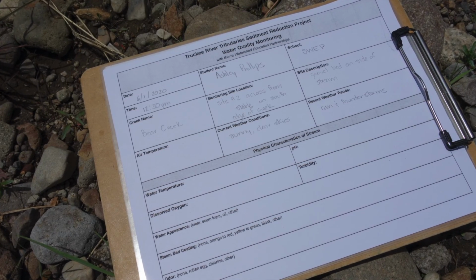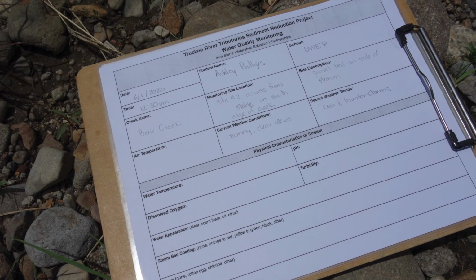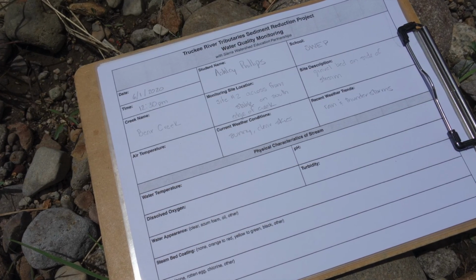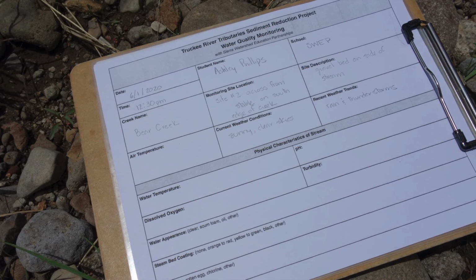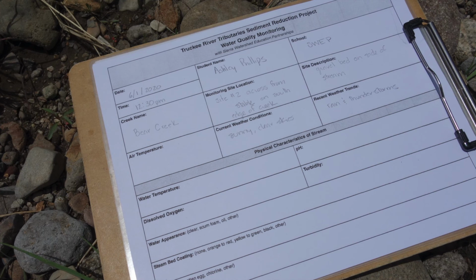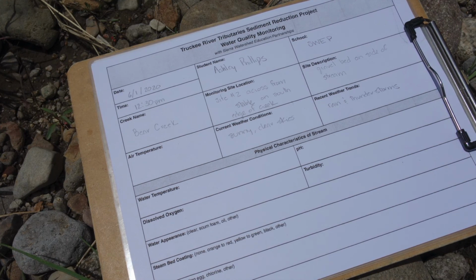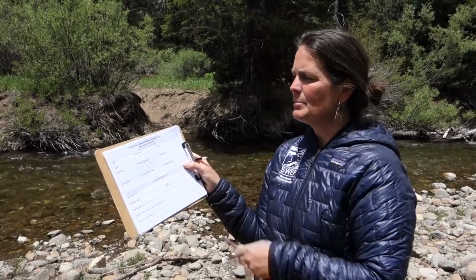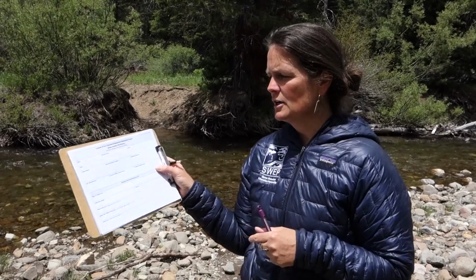Also, you want to make sure you get the current weather conditions, because that can also affect what you find in the creek. If it's been raining a lot recently, you're going to have a lot more runoff, and that might stir up the water. So make sure that you write that down, and any recent weather trends are really helpful. So after you've filled out the top part of your data sheet, that's where you are, when you were there, and who you are, then you're going to start collecting the data.